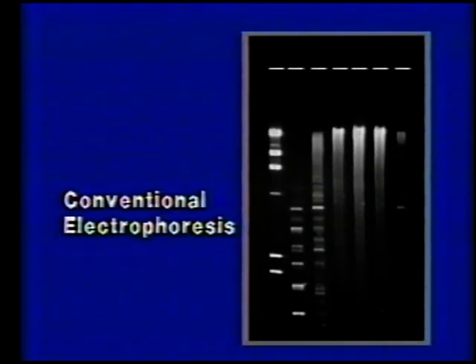However, it is found by experiment that in a field of several volts per centimeter, molecules larger than about 20 kilobase pairs stop losing mobility with size and travel the same speed regardless of length. This gel photo shows a variety of large DNAs, up to several million base pairs, partially digested with restriction enzymes. The samples were loaded at the top, and the smallest molecules have proceeded to the bottom. The limit of mobility for large linear fragments is located here, with species from 20 kilobase pairs on up to megabase pairs, all coming to the same point.